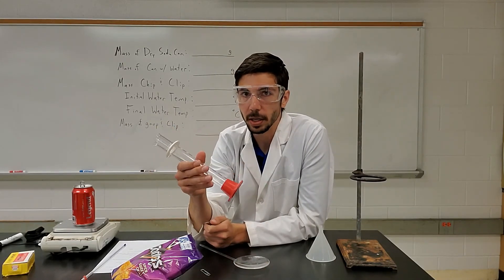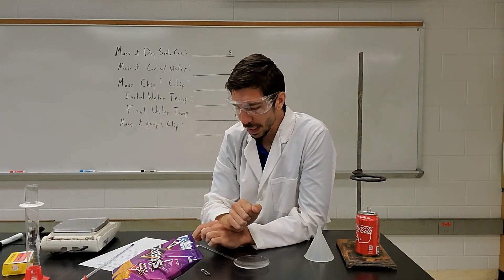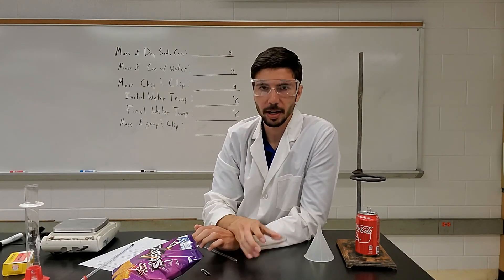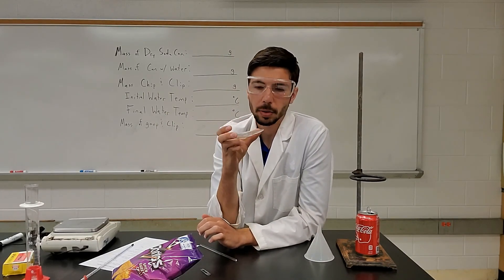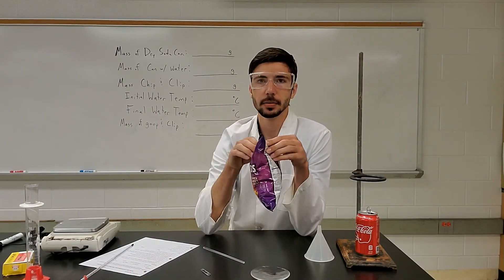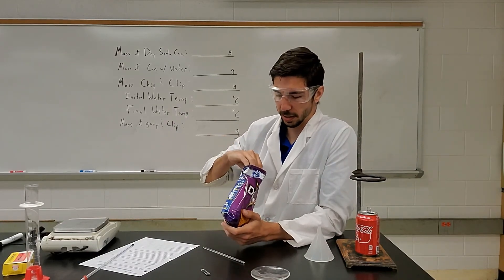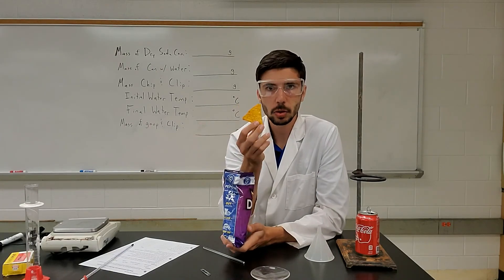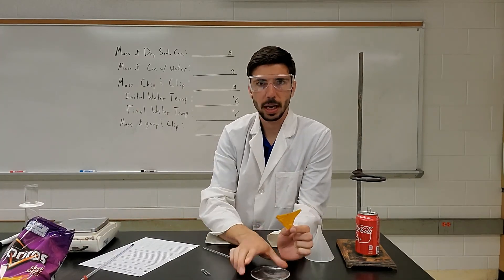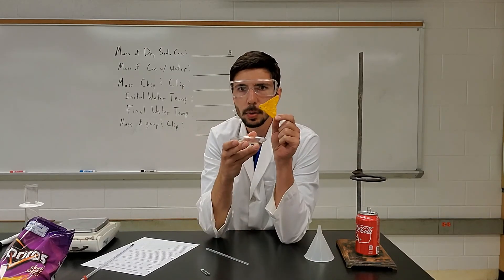Next we need the mass of the chip. I have a watch glass — you don't have to have this, but it's a good idea to have something underneath. Go through your bag and get your chip. I have the spicy sweet chili chips — they tend to work pretty well. Pick a good size, a full chip. We're just going to be dealing with one.